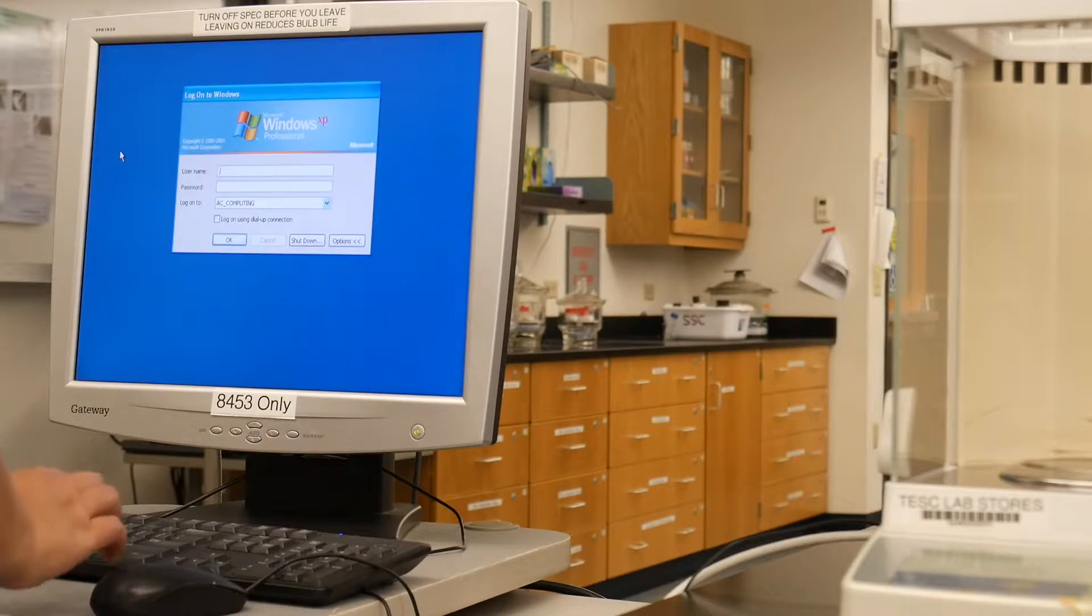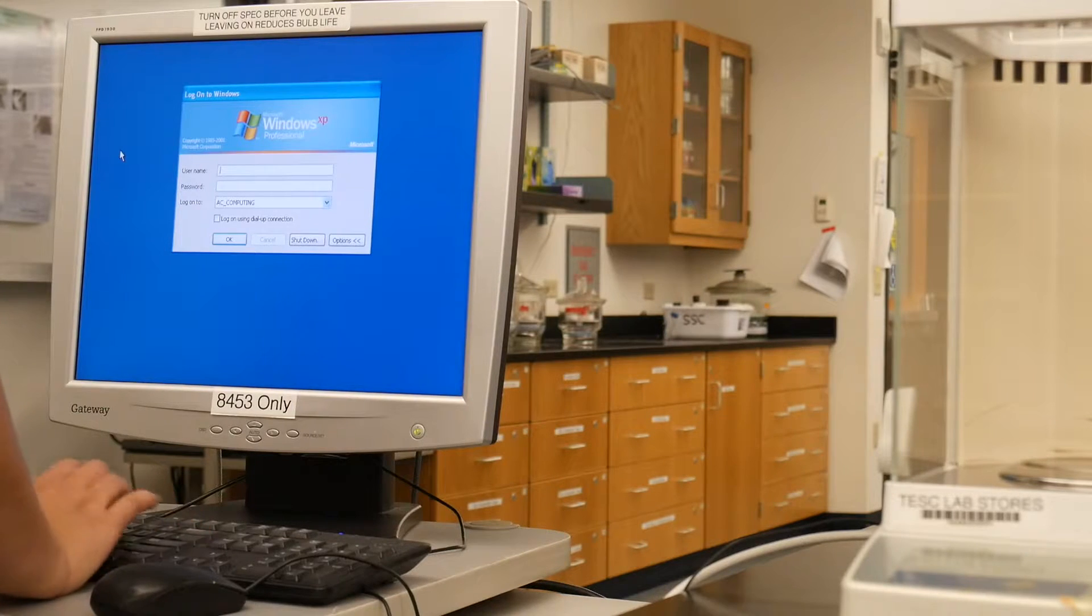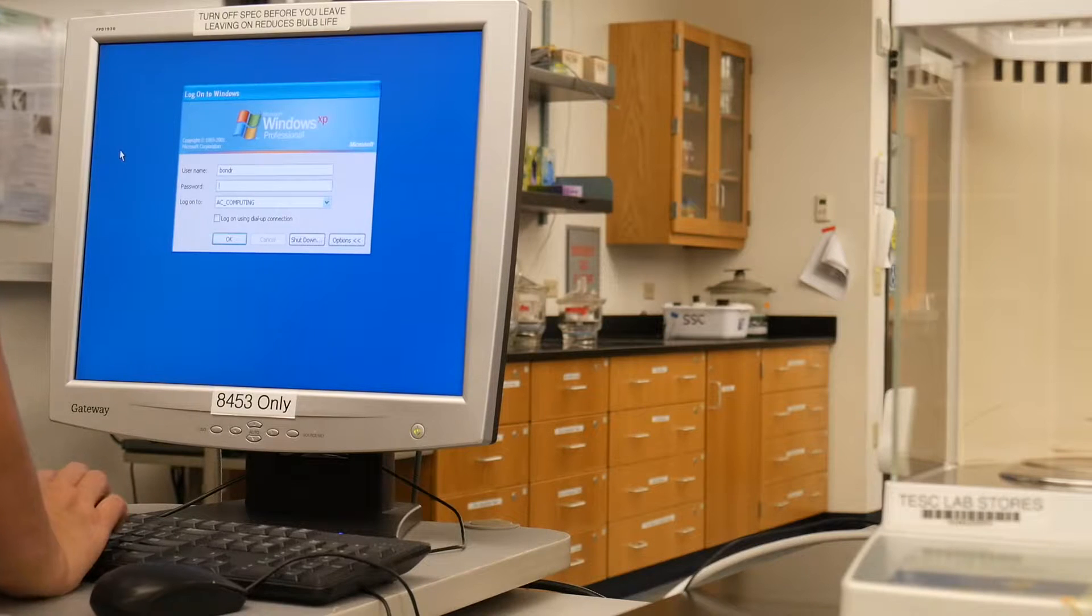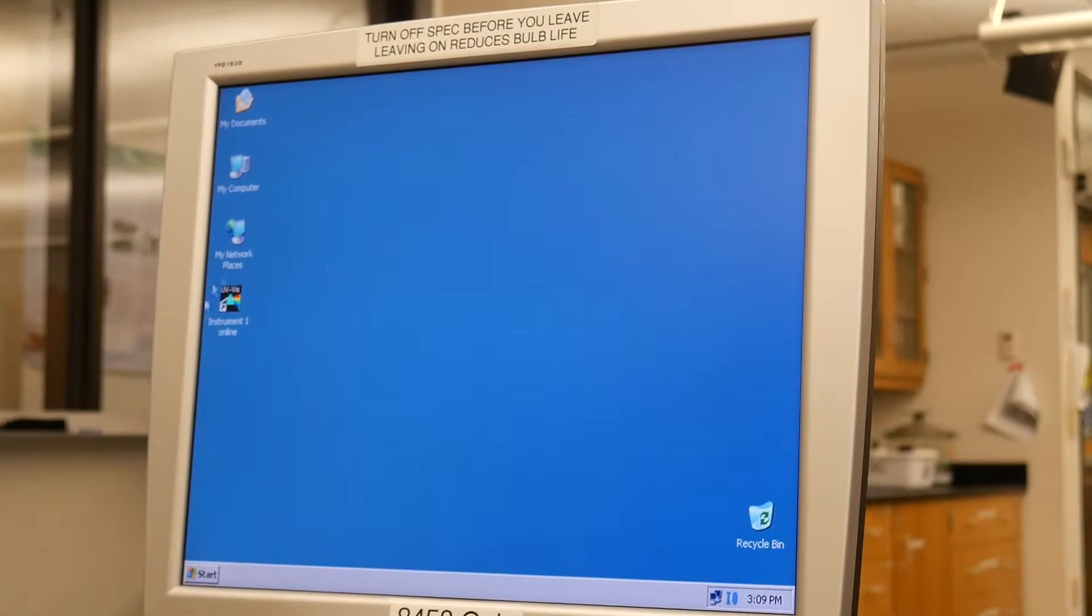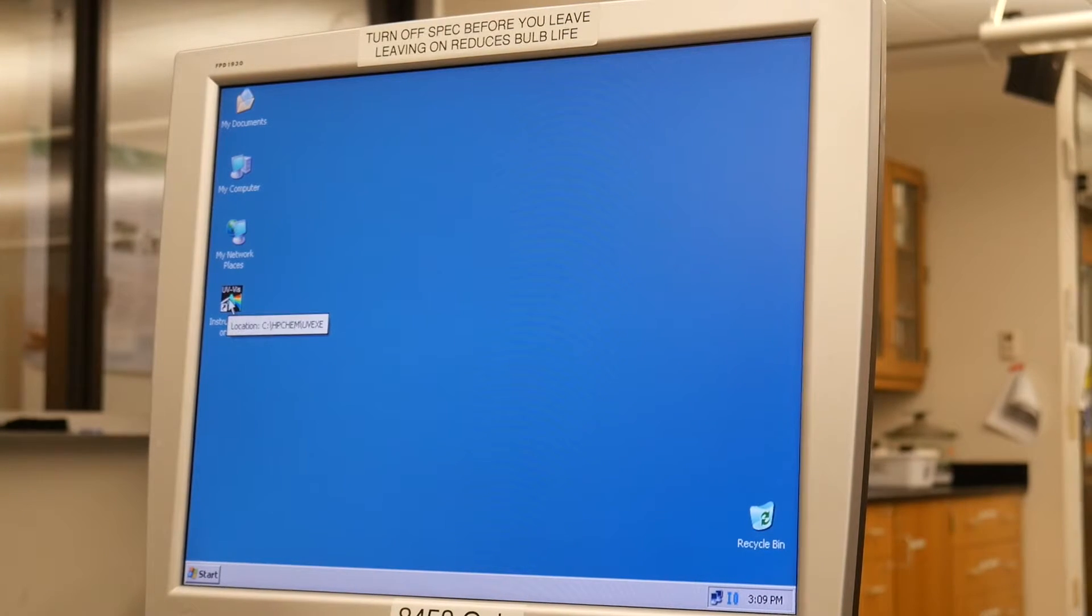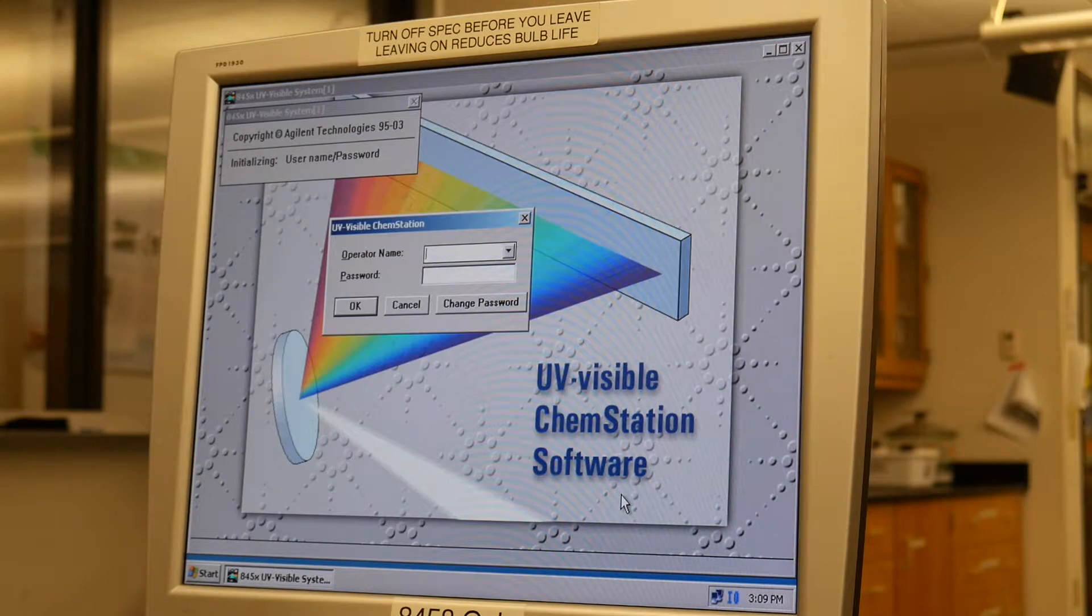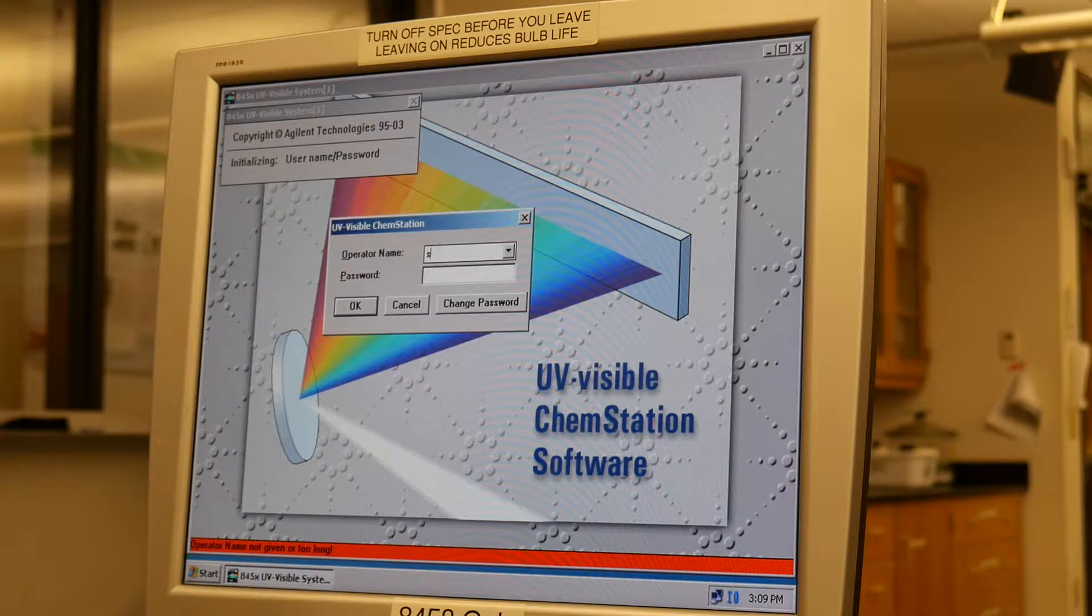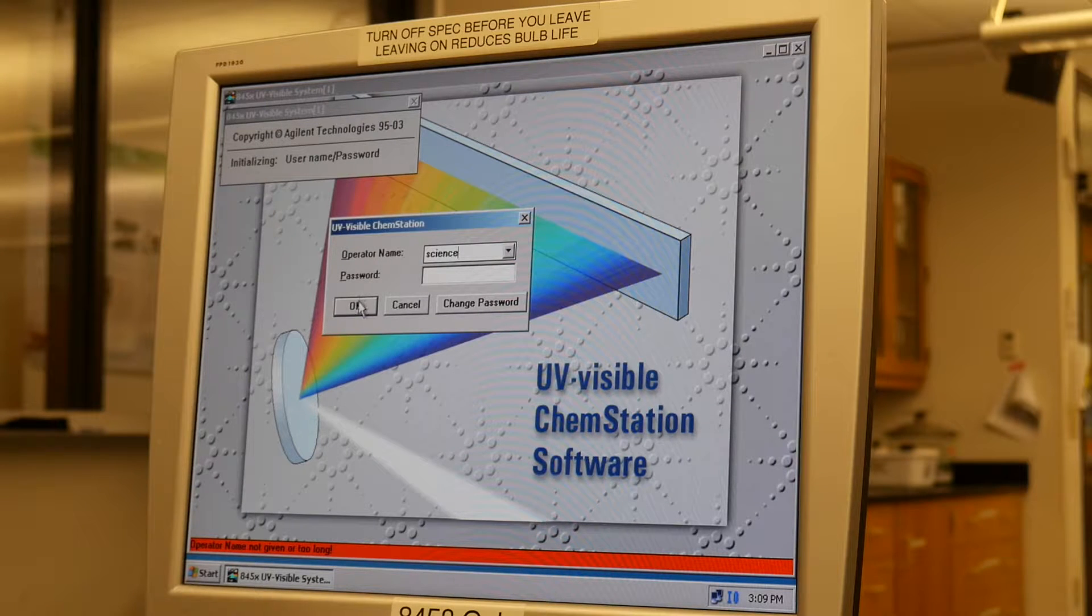The first thing you want to do is log in to the computer. Next you're going to click on instrument one online. And you should go into the UV visible chem station software. So you're going to want to put in the operator named science, and there's no password.